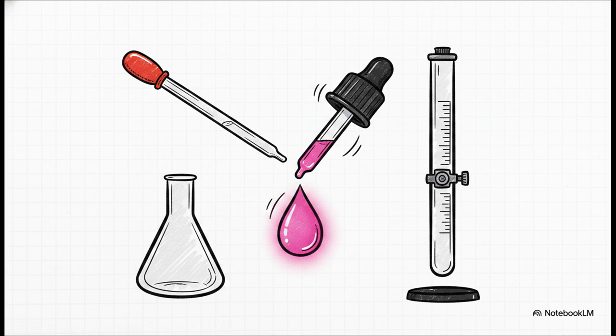But pay special attention to the last item on this list, phenolphthalein. That is our visual informant in this case. Without it, the reaction would be completely invisible to the naked eye.